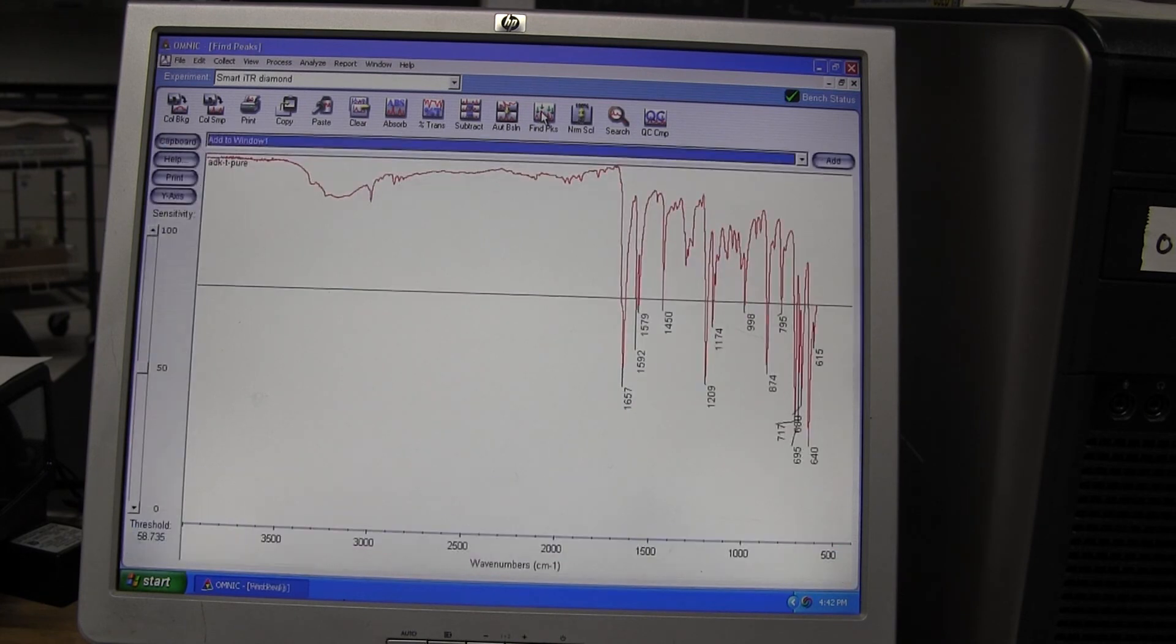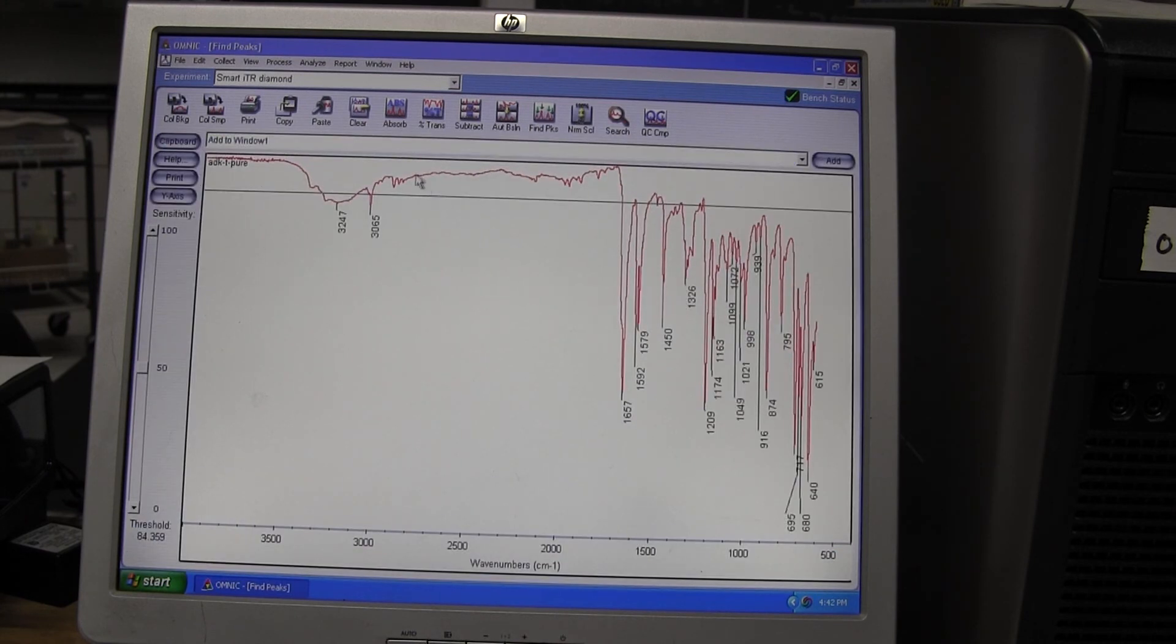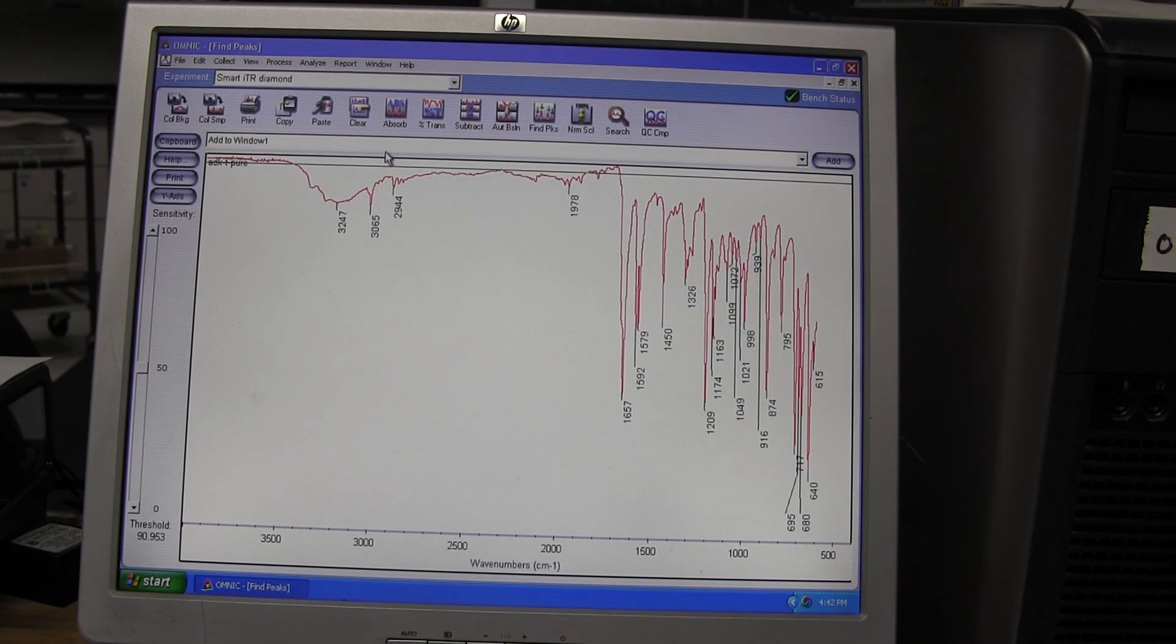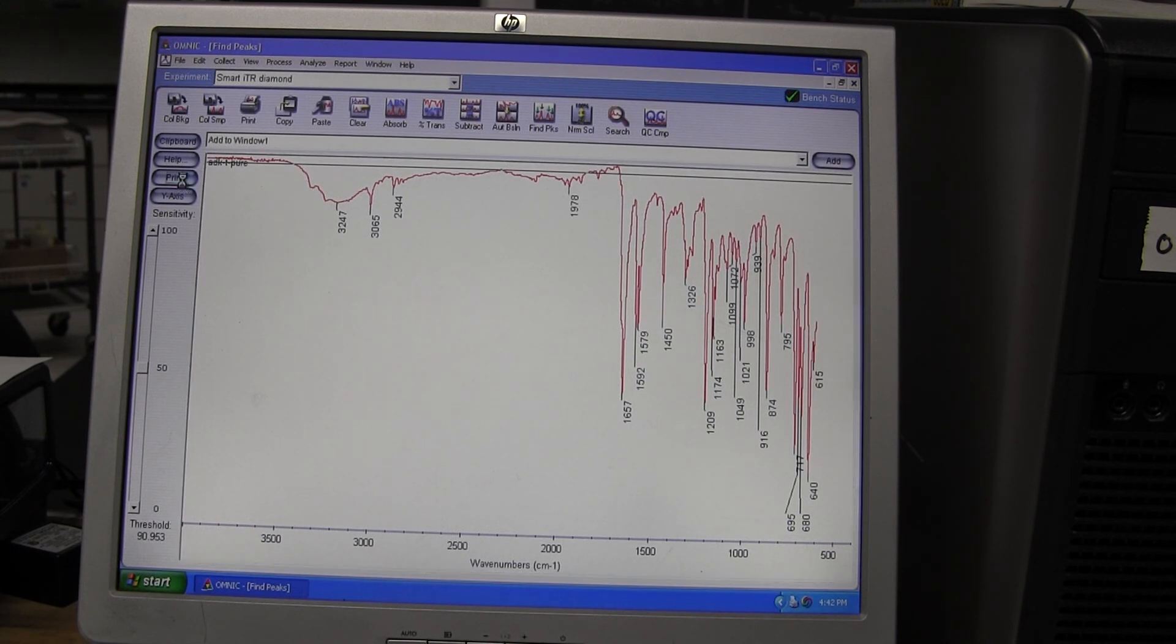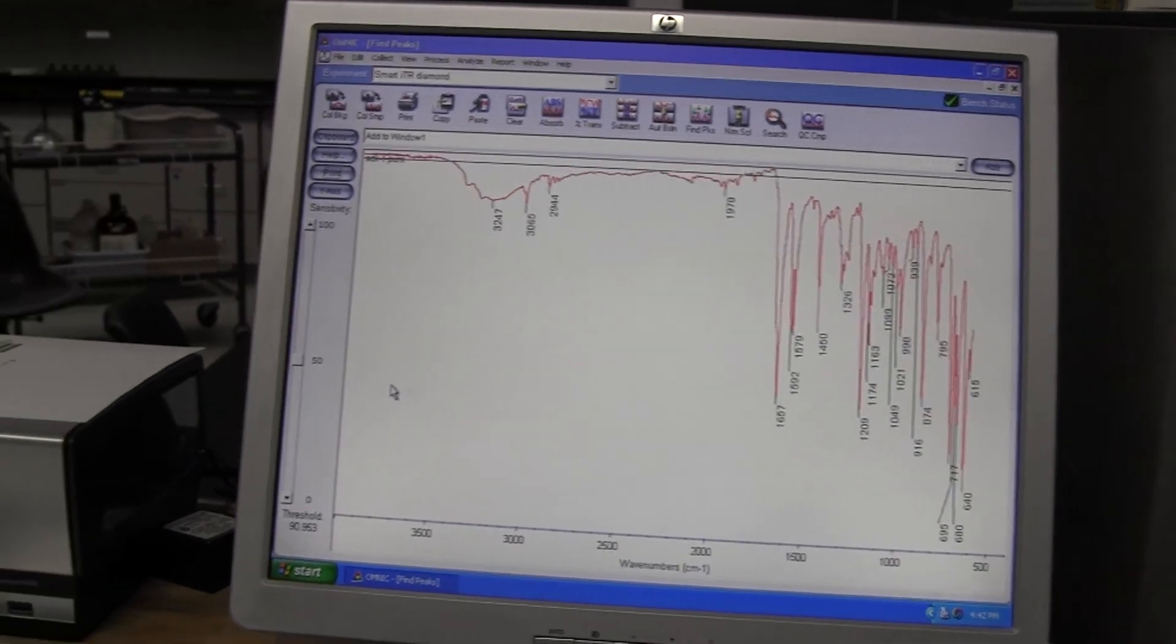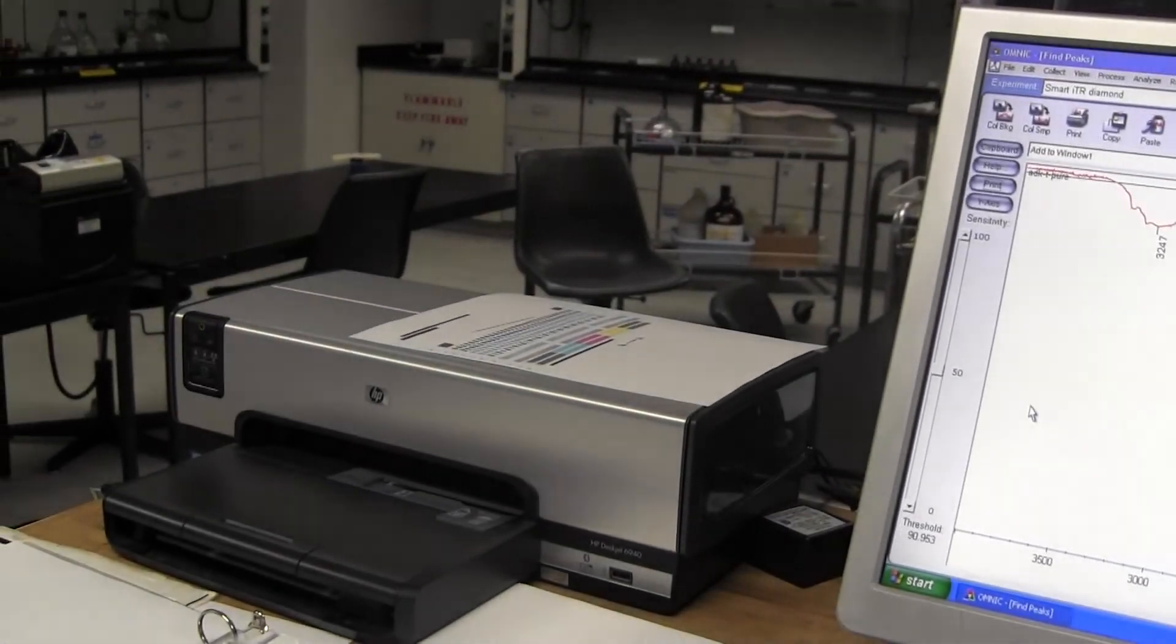If your graph disappears, go to the drop-down menu below the top bar and choose the window that your sample was added to. Highlight the other data and select Delete. You will then be able to choose the Find Peaks option and print your IR.